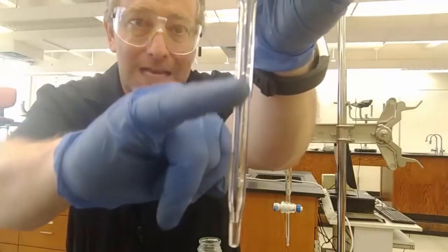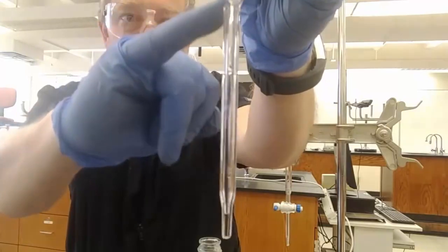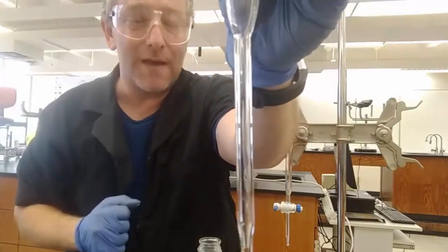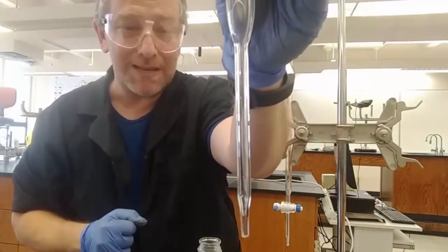That is not supposed to happen. It has not delivered 10.00 milliliters. This pipette needs to be thrown away. However, it's a nice way of us explaining any error that we get at the end of the lab, so I'm going to keep using it, okay?